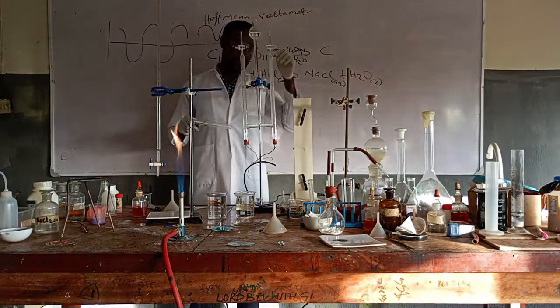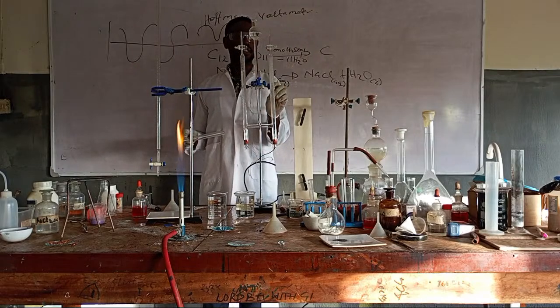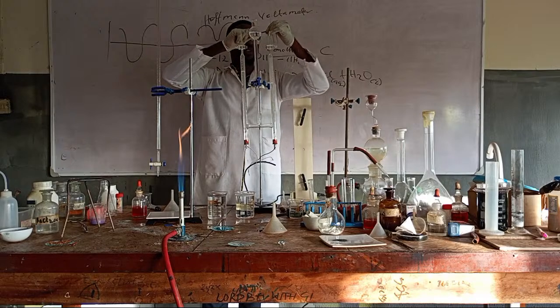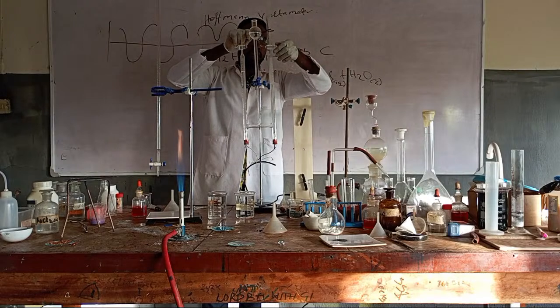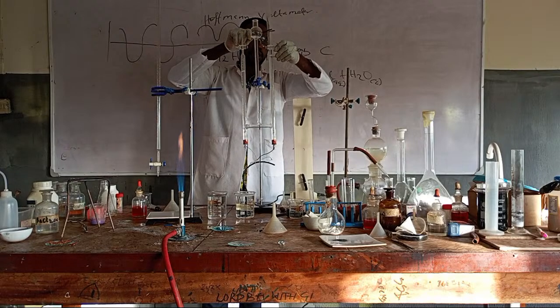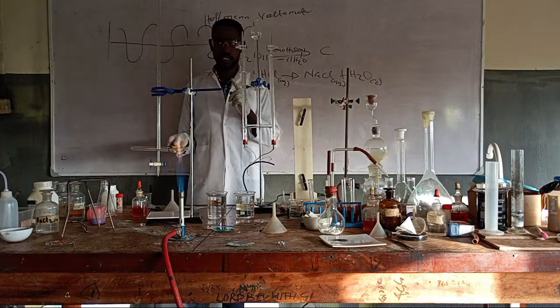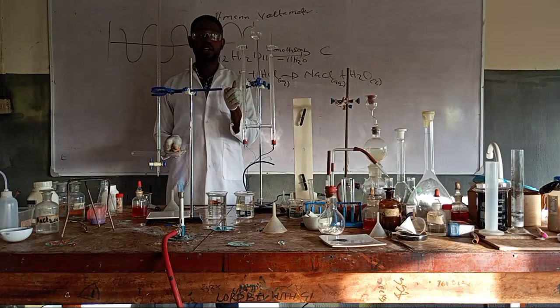I hope I'm not hosting mad people here. So the thing continues and is keeping the rate. Hydrogen and oxygen. So let me check what's up with hydrogen. Remember, hydrogen is insoluble in water, right? That means anything here wouldn't be a problem for us. So that shows we have split this water into hydrogen and oxygen.